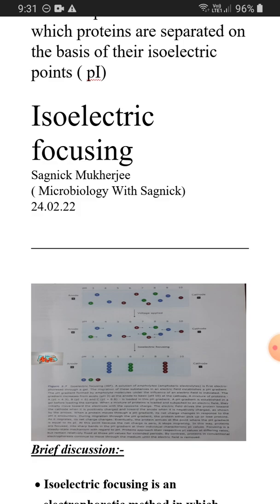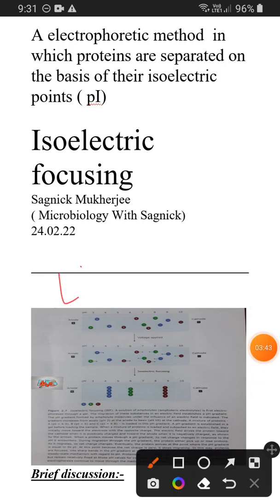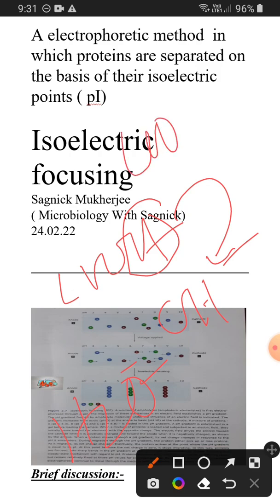That means this hydrogen neutralizes the OH- and gives you water, and the amino acid remains deprotonated. The condition is just like that: COOH and OH- are present in the environment, so H+ will be donated by COOH and convert the OH- into H2O, and in turn the COOH becomes COO-, and the amino acid is negatively charged.